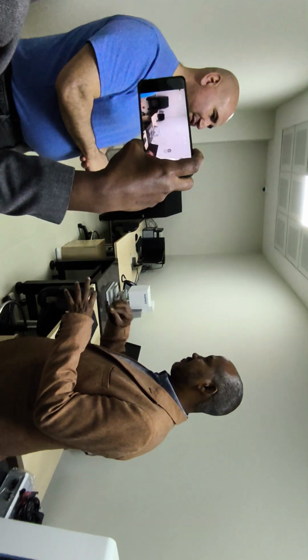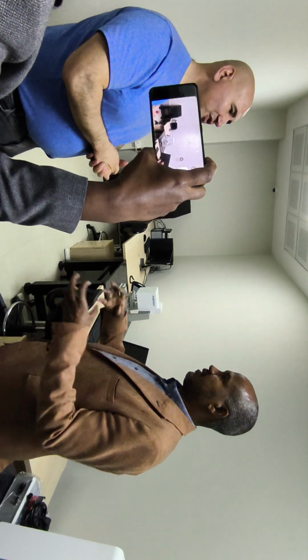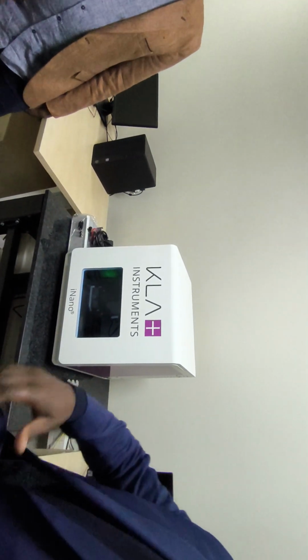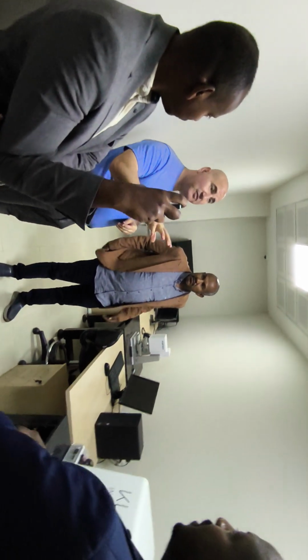You can find differences in the surface roughness, and the chemistry is also different. Here you can see it with EBSD, because you will see some crystals like this one, others like that, so you can also see the grain size and the surface.